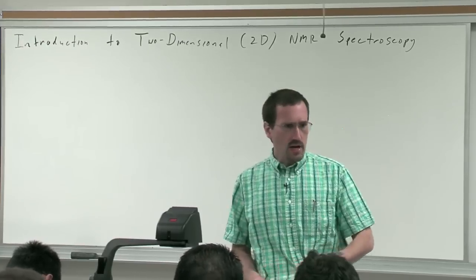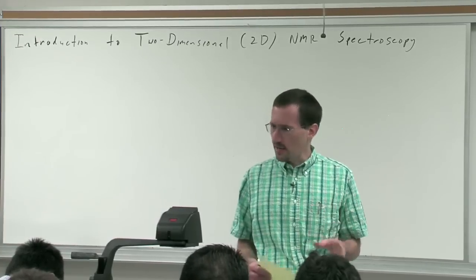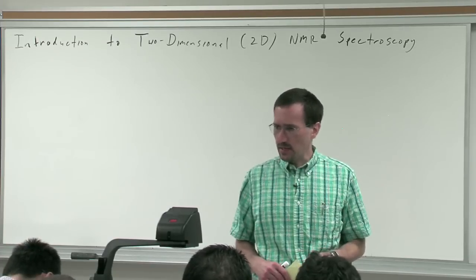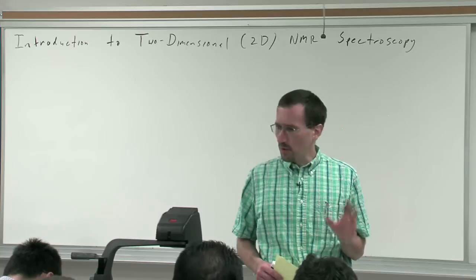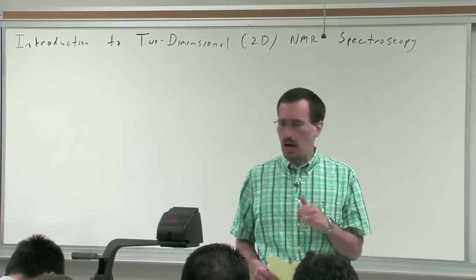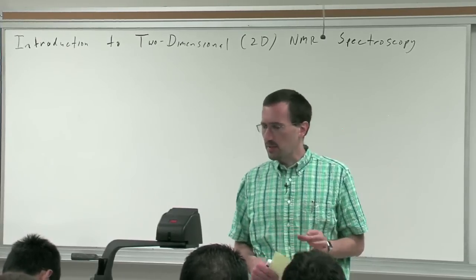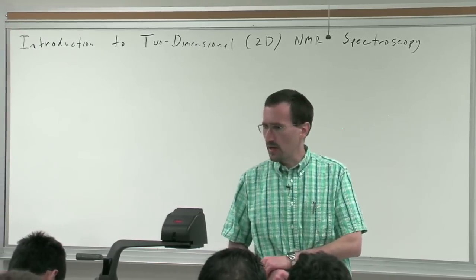But rather than trying to talk broadly about everything, we're going to focus on getting a few tools in our toolbox and see how to use these techniques to address different problems. We'll start out with two tools in the toolbox. That will be HMQC and COSY techniques. And then we'll add some more tools, and I'll try to put them into some sort of context.